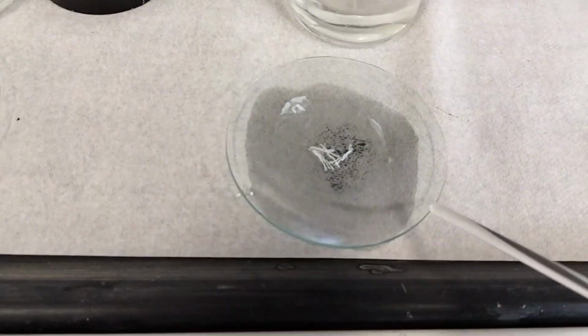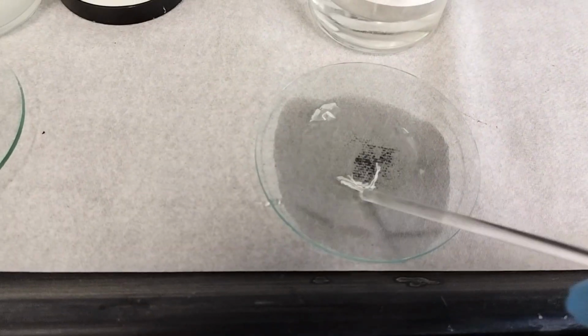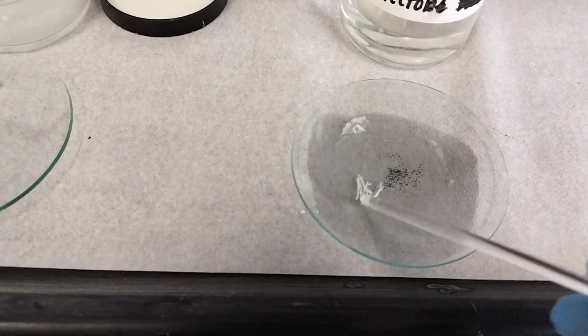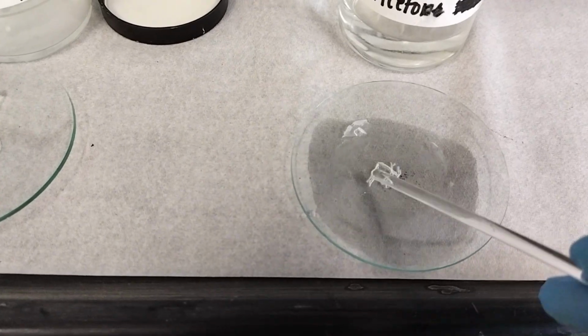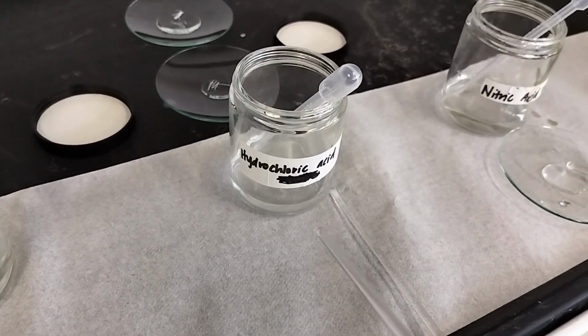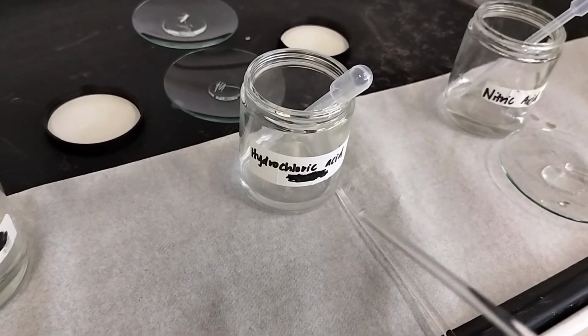After waiting a few minutes, we can see that the fiber did not dissolve in acetone. So this confirms that the sample is not acetate. So we will continue with the next chemical test.